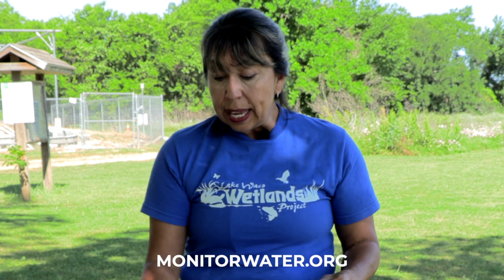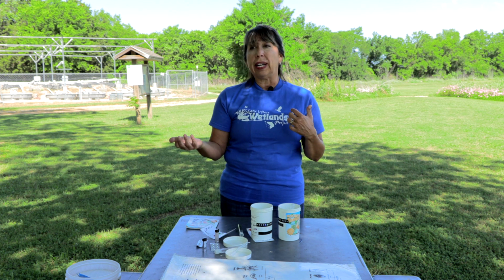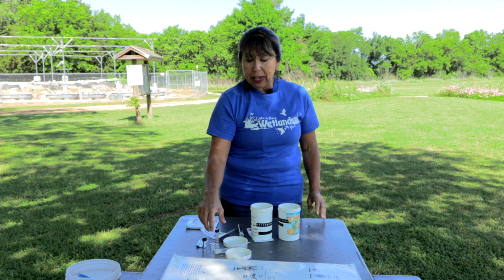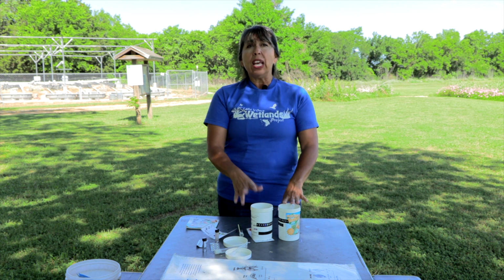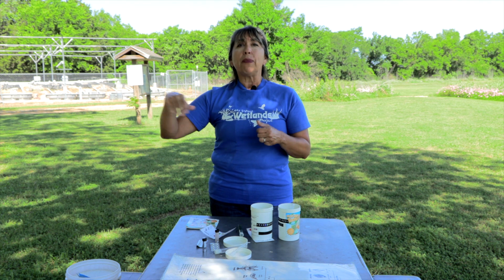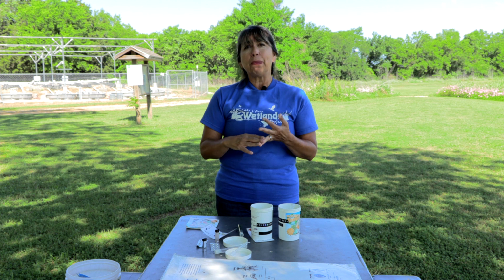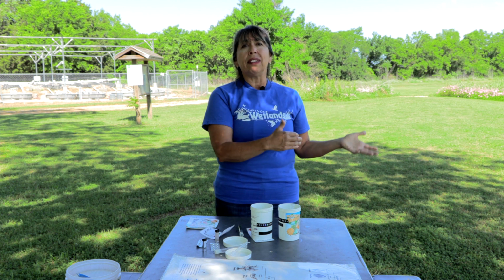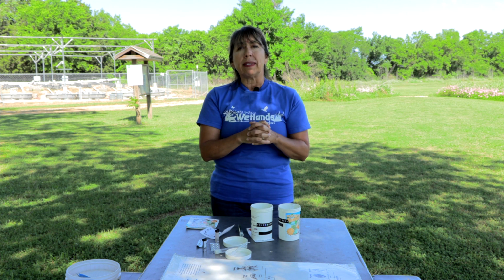Again, this is just a really simple water test that some of y'all may do if you have pools or ponds or even hot tubs in your area or where you live. Scientists take these types of measurements. We go a little bit more and we take conductivity, we take carbon dioxide measurements, different types of measurements that tell us how healthy that water system is before it goes into our water treatment systems.